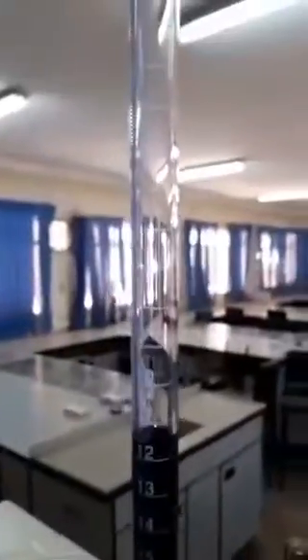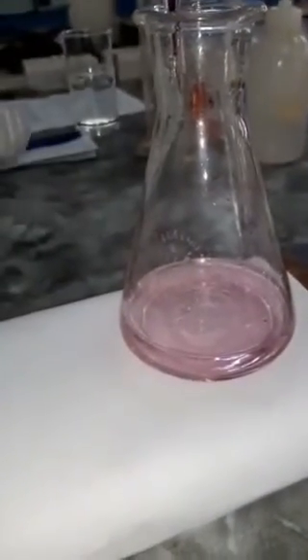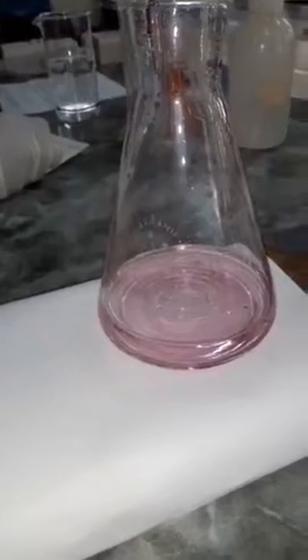Okay, so there we have a color change. It's pink, a light pink. So our reading for this titration is 11.6. So if we subtract our initial reading, which was 5.7, if we subtract the 5.7 from there, we have 5.9. So the titer value for the second titration is 5.9. So I'll write down 5.9 mL as the titer value. So 11.6 mL.